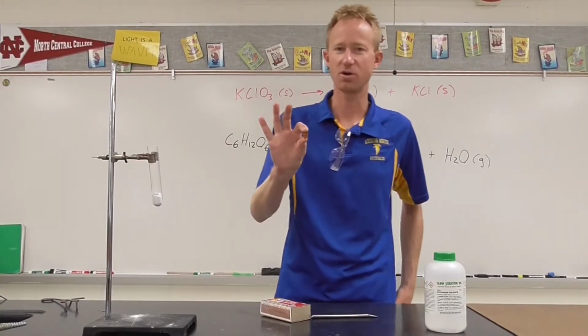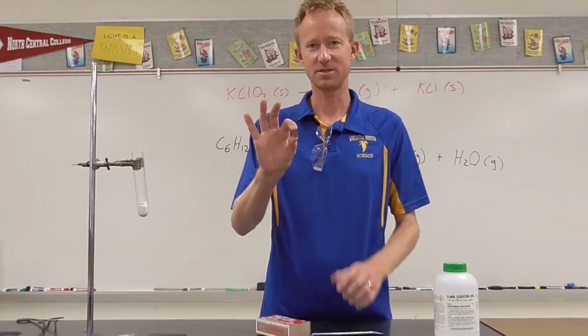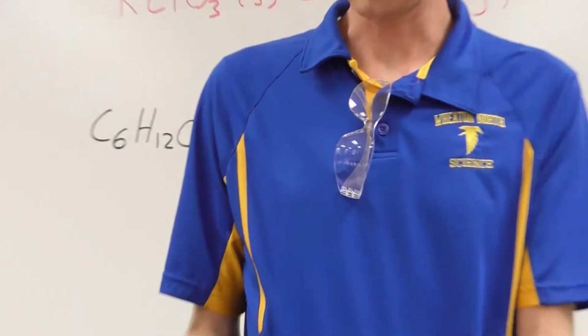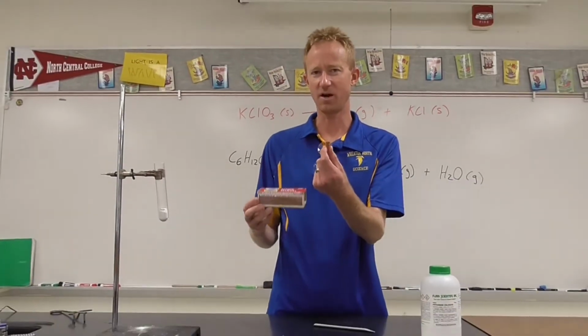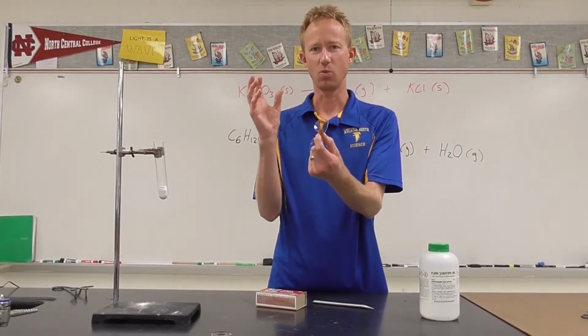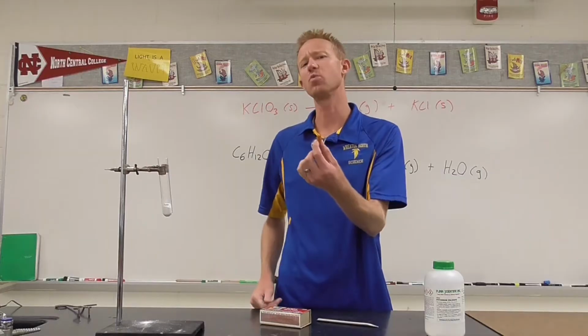This demonstration is called the Gummy Bear demonstration. What we're going to do is combust this gummy bear. Now that doesn't sound very dramatic, because what we could do is light this on fire with a match, and we could witness the gummy bear combusting with oxygen from the atmosphere. And it would just burn, but like I mentioned, it wouldn't be very dramatic.